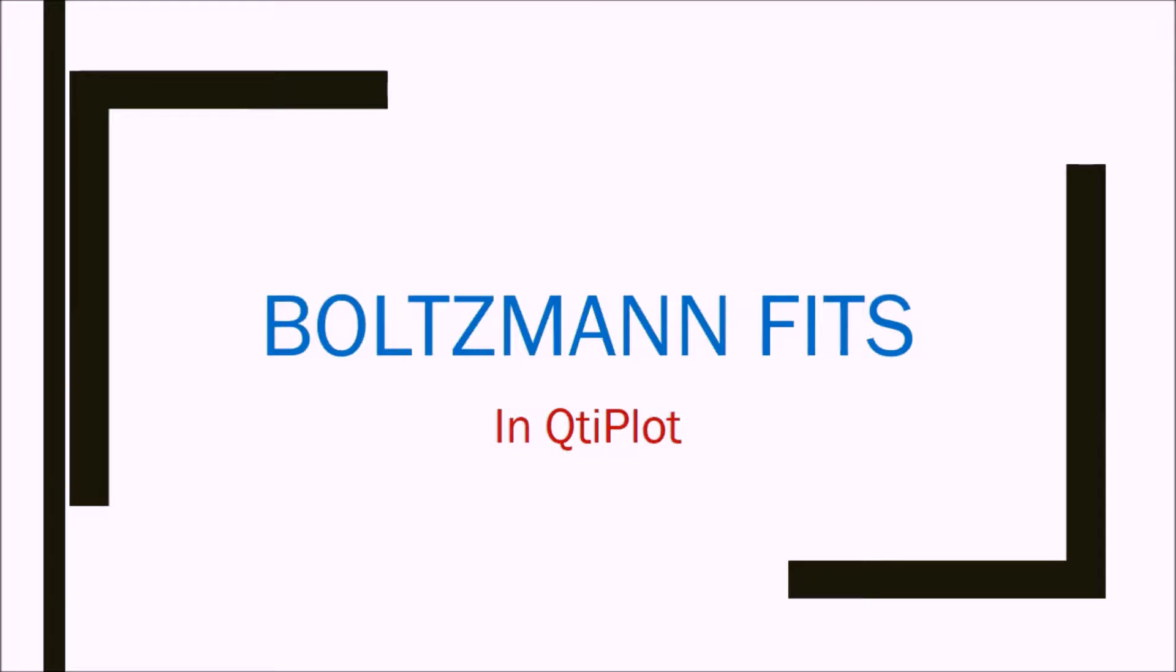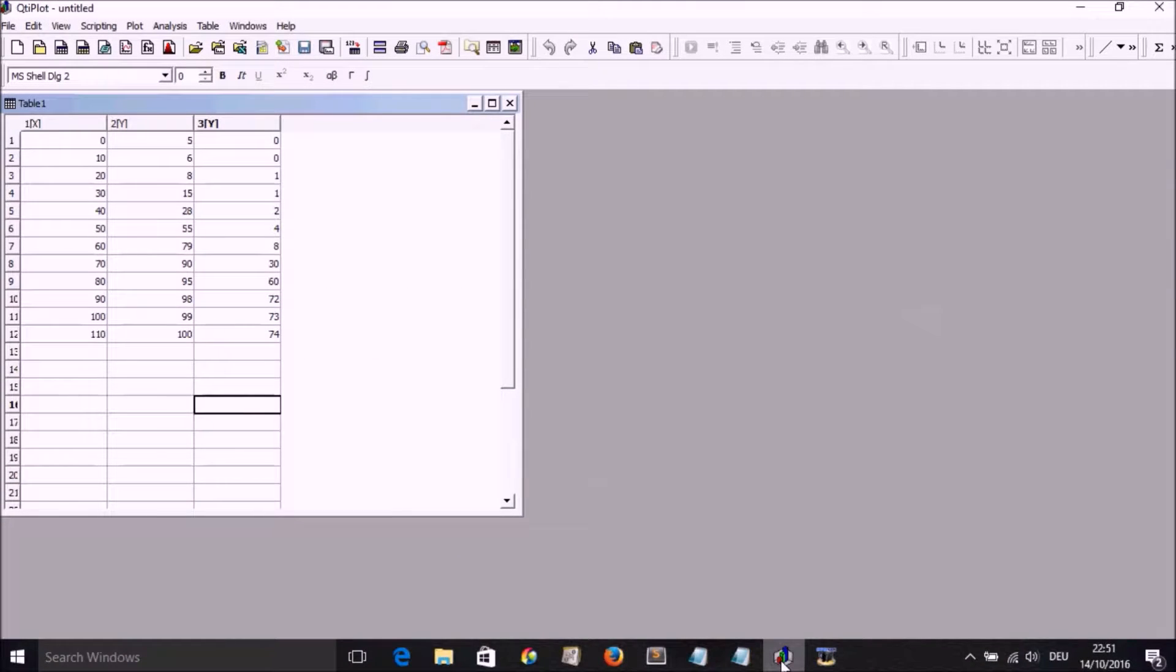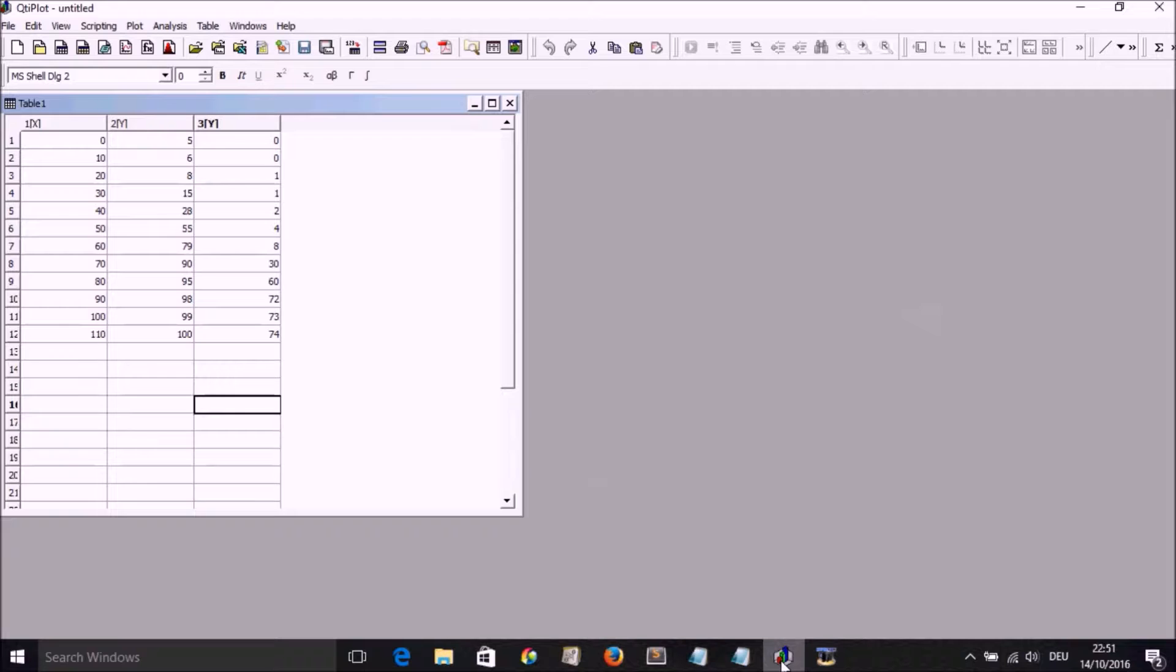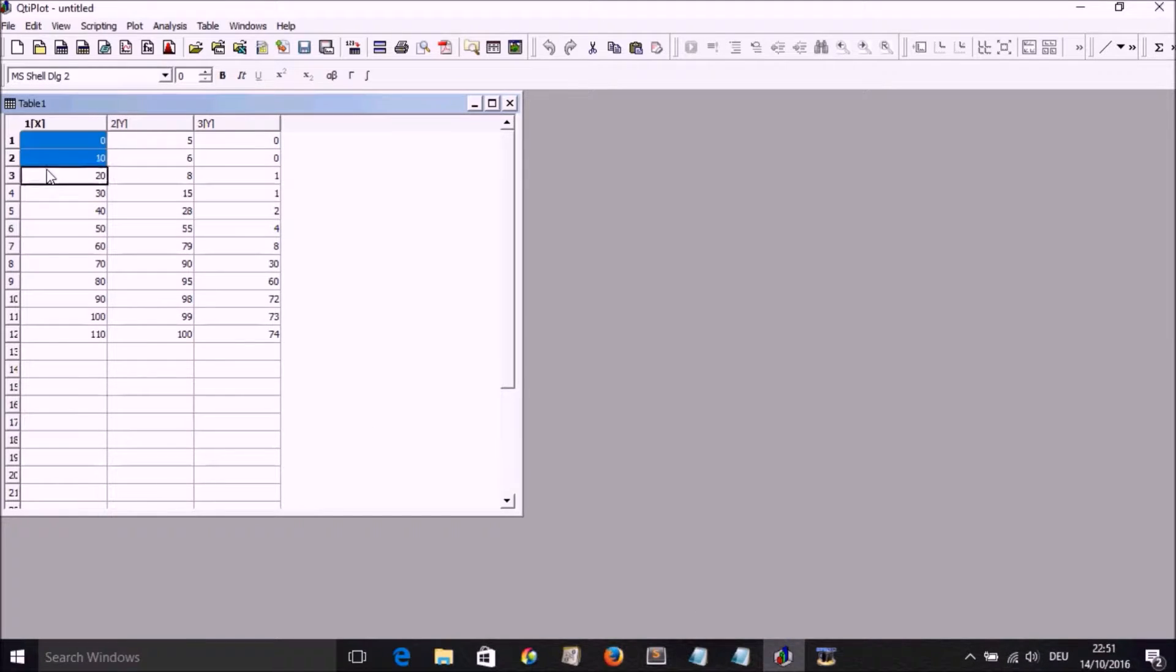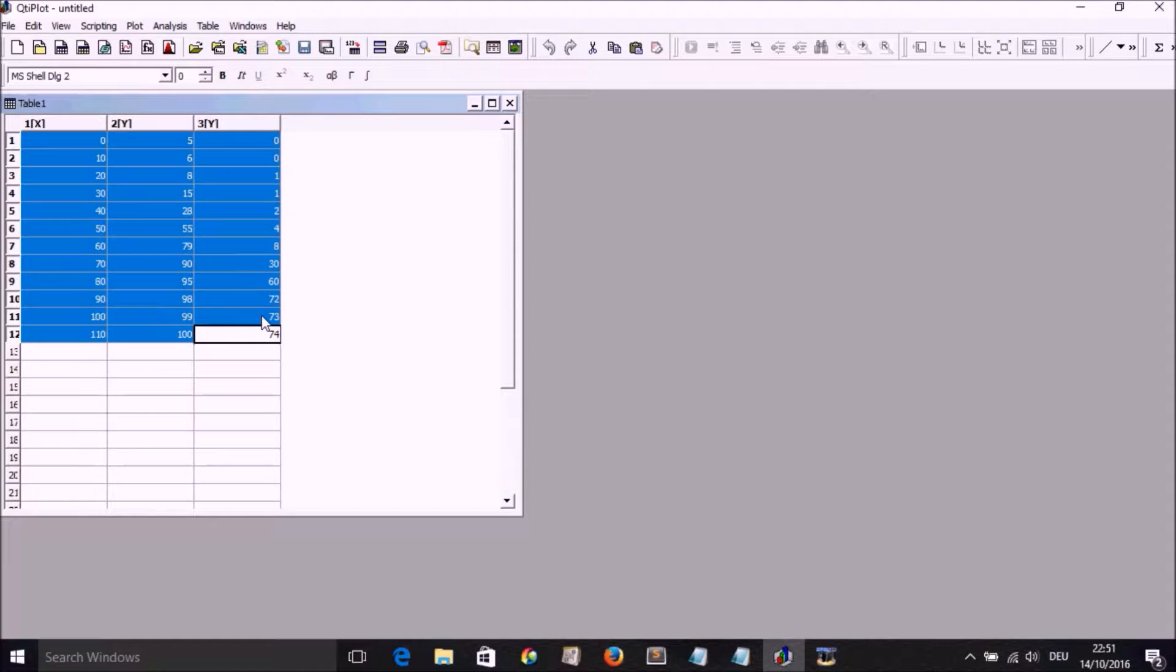So we are going to see how we could use QtiPlot to generate growth plots. Let's get started. Here's QtiPlot. I've thrown in some data in the time and OD. Imagine the OD optical density converted to percentage. We highlight the data.